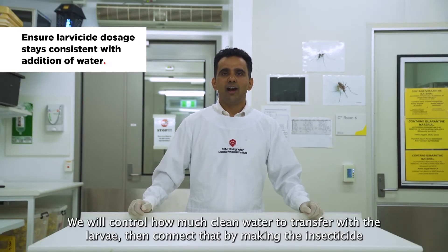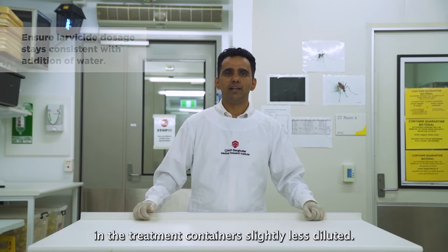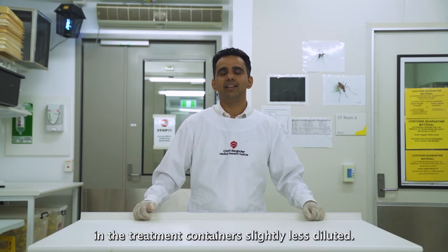We will control how much clean water to transfer with the larvae, then correct that by making the insecticide in the treatment containers slightly less diluted.